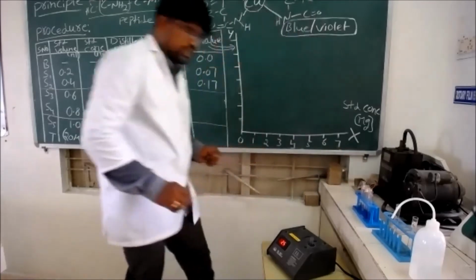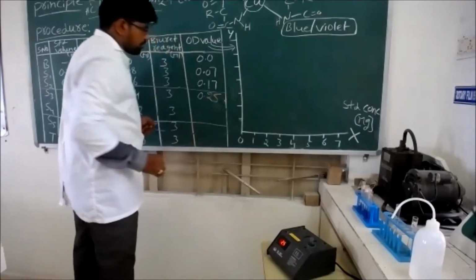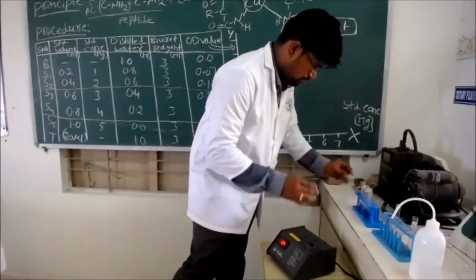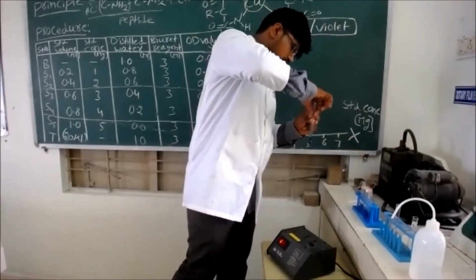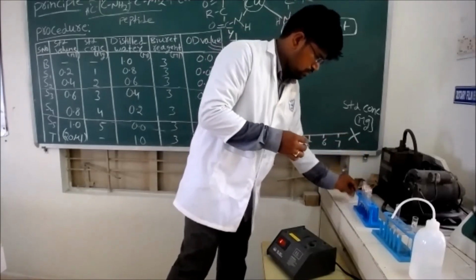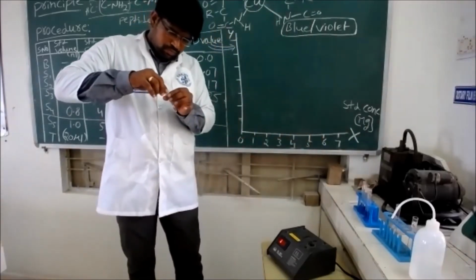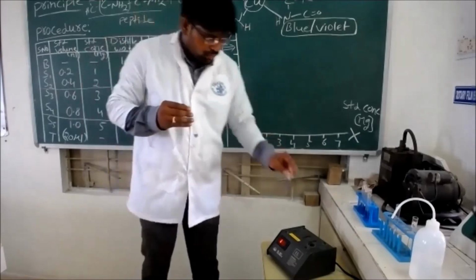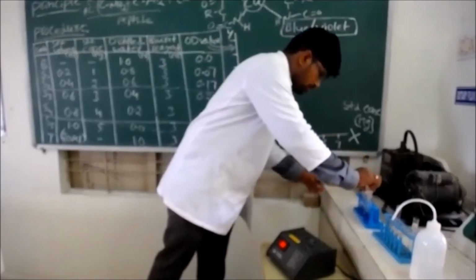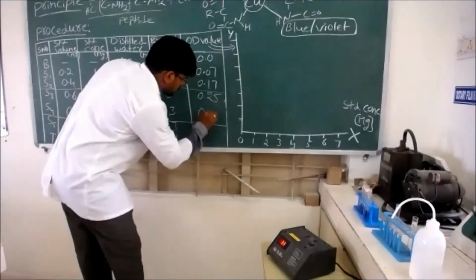The reading with S3 is 0.25. So prepare the S4. The reading with S4 is 0.33.